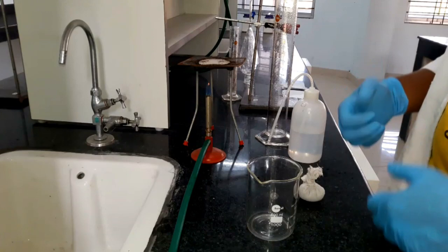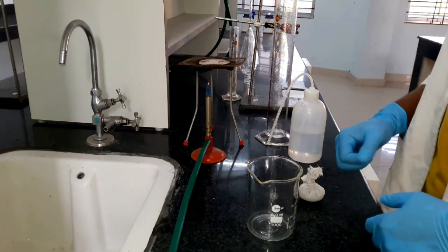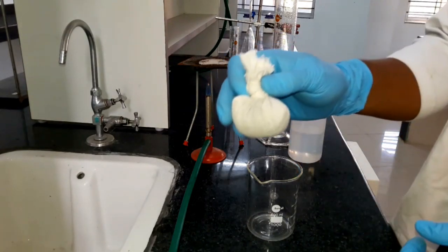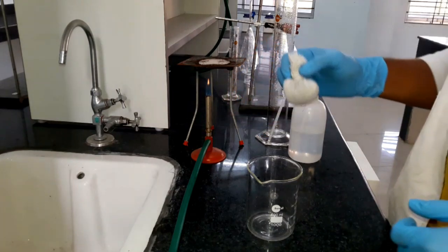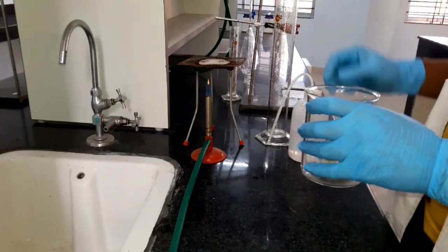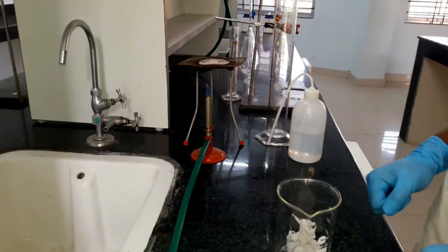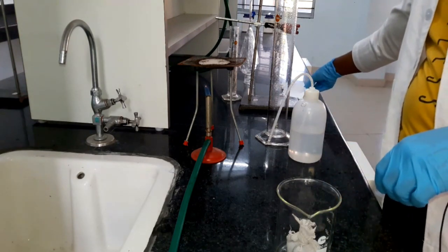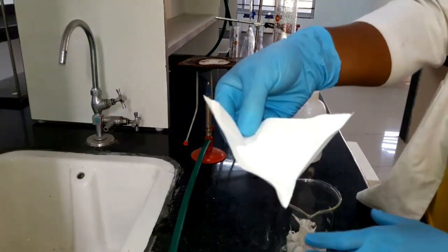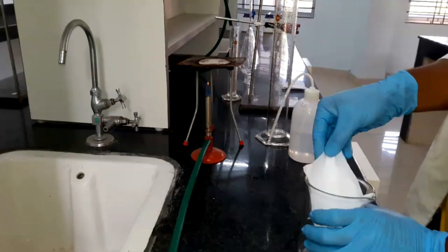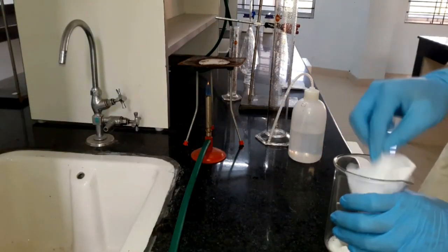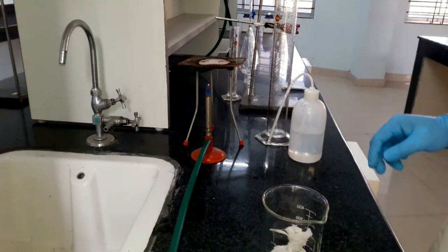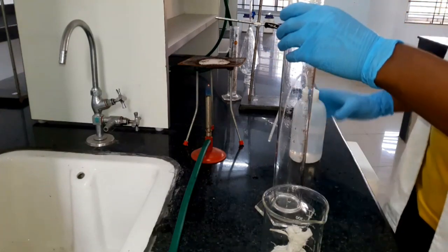Today we are going to extract caffeine from dry tea leaves. At first we take 15 grams of dry tea leaves in a 500 ml beaker, and then 10 grams of sodium carbonate is added to this beaker. Now we add 150 ml distilled water.